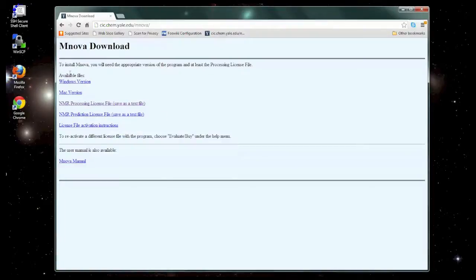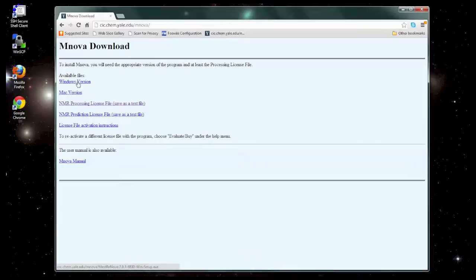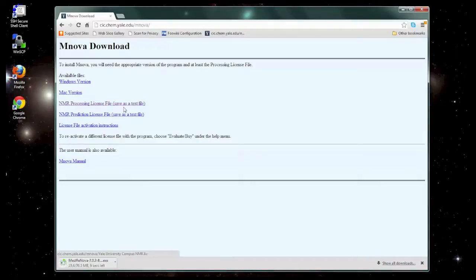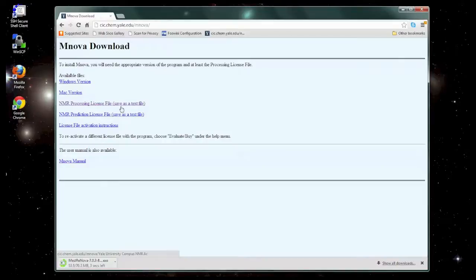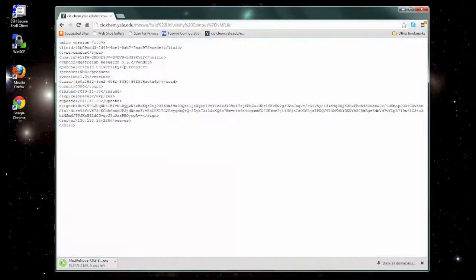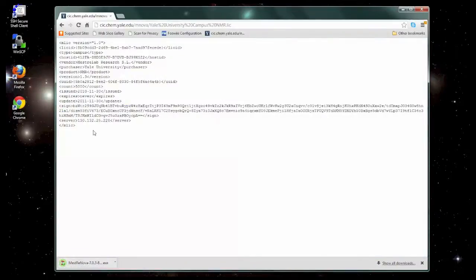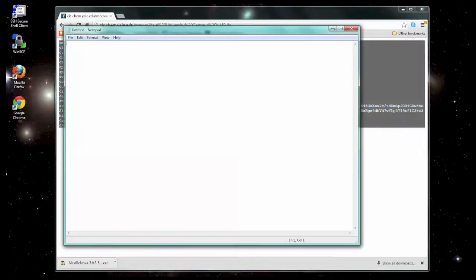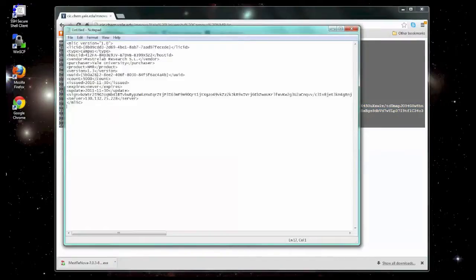You'll find a page where you can download several different things. We want to download the Windows version of the program. We're also going to need to download the NMR processing license file. Now this may cause problems depending on how your computer is configured. So one option is to just click on it, and you should see what looks something like this. Go ahead and highlight it, hit Ctrl-C to copy it, and then open up a text program like Notepad and paste it in there with Ctrl-V.